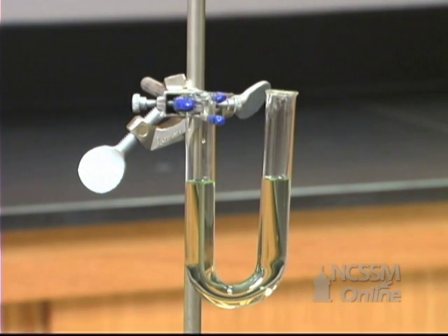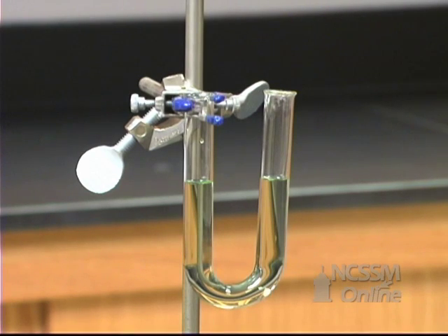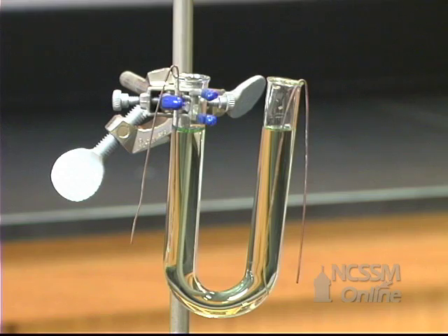We've placed a one molar solution of sodium sulfate in the U-tube and added some bromothymol blue to the solution. The solution is green because the pH of the sodium sulfate is 7. We've put copper electrodes into the U-tube.